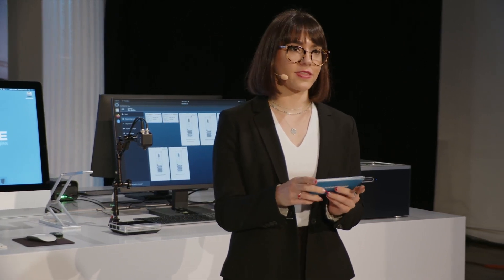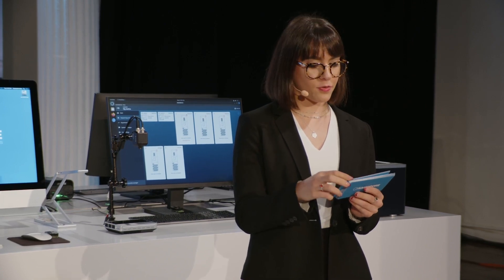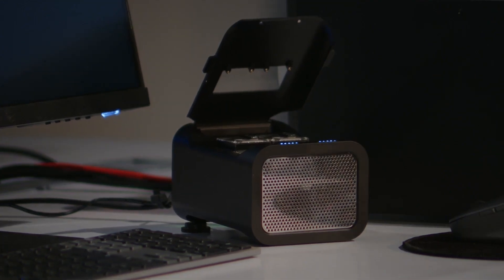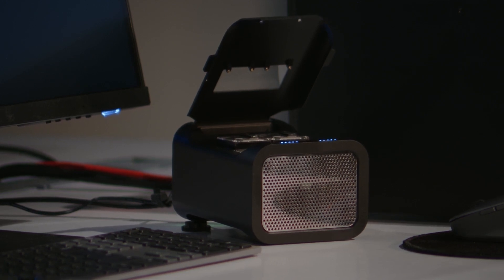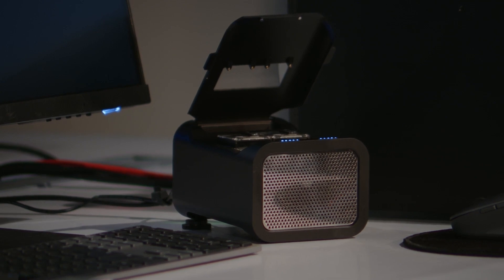The larger devices arrive with capable compute units to ensure that your analysis can proceed no matter what you throw at it. On the other hand, the sleek and accessible P2 Solo can be attached to any computer that meets specifications, whether that be the GridION or something you already have in the lab.